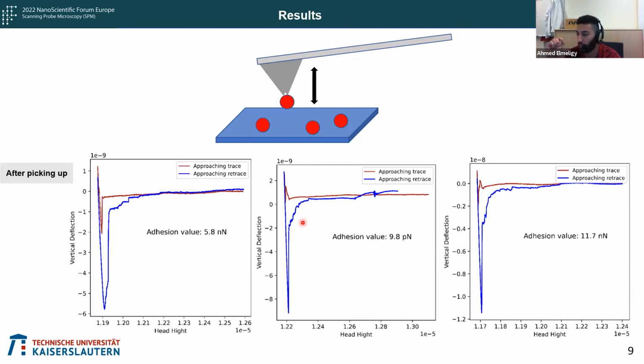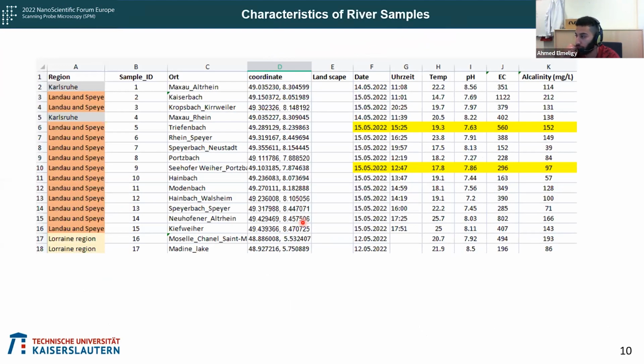Of course, there is a lot of variation in the force curve in the middle, but to save time for this presentation, I just give you the minimum value and the maximum value that I have got so far for these results. As I explained, since the parameters are so important, we're focusing on changing all the parameters together to maximize opportunities to investigate how changing the parameters can cause differences in the results.